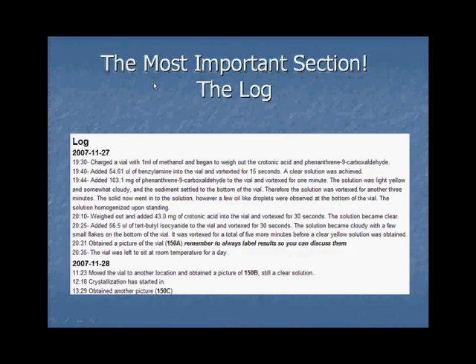All right, another section of this page. Again, I'm going through this long, long page that's one experiment. Is that there has to be a log. So we can actually construct the rest of the experiment based on the log, but without the log, we can't do anything, right? Because you can't remember what you did exactly when you added things, exactly when you measured them.